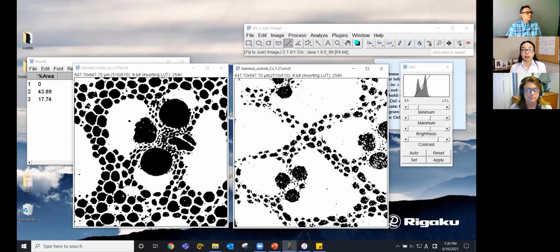Okay, so when you're doing a volume or area fraction, by the way, you don't necessarily need to set the voxel size because you're just looking at the ratio. But we thought we would ask this question at this point.